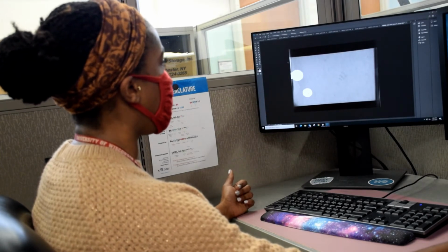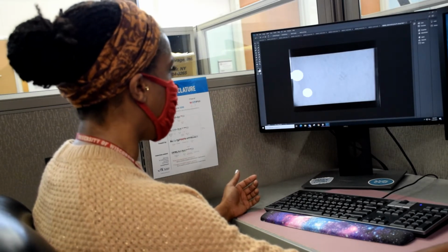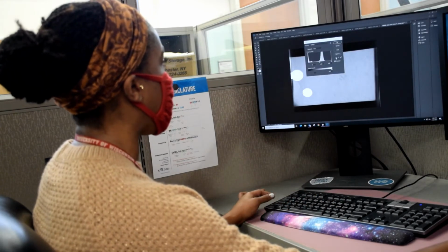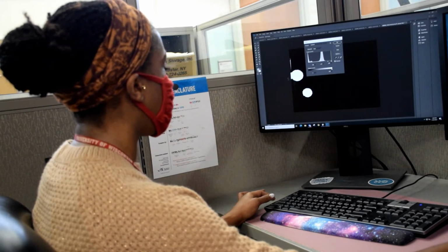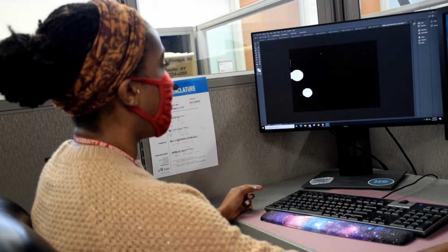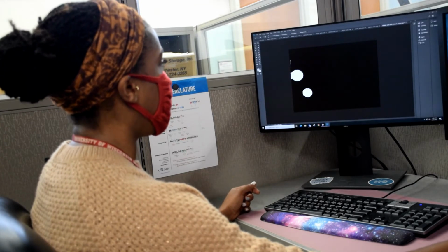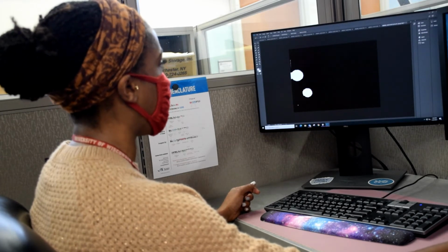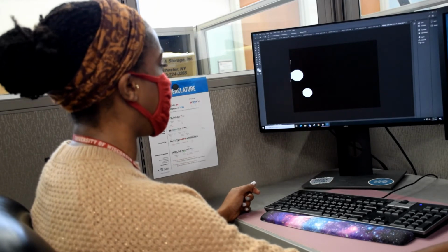But now we need to make sure that the background has full contrast with the actual urine spots. So in this case, we're going to select our levels again, and this time black out the background and try to get it as dark as possible. Alright, that looks great. Now with this image, we're going to download it into another software. This software will actually quantify the size of our urine spots, along with their location and how close they are to the periphery, and how many of them actually exist. So let's give this a go.